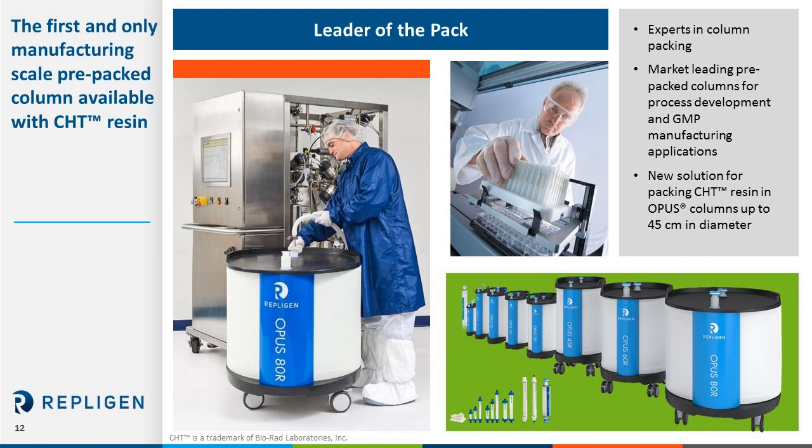So it's one thing to say that we have been able to ship a few columns or to demonstrate that the columns can be shipped through an ISTA study, and it's another to show that the method is in fact reproducible over different size columns, different types of scenarios, different resin lots, et cetera. So with the data shown here, we can be confident that the method is reproducible with those different variables in terms of size, resin lot number, operators, et cetera.